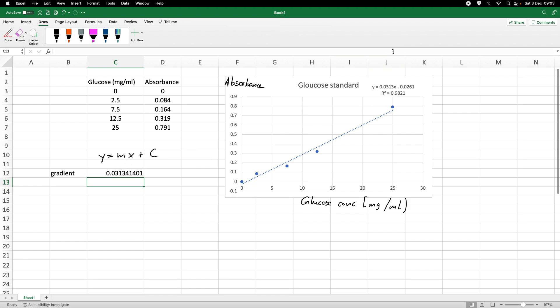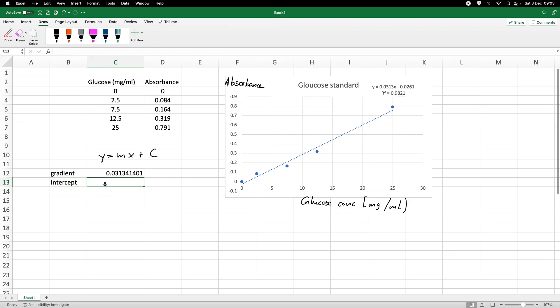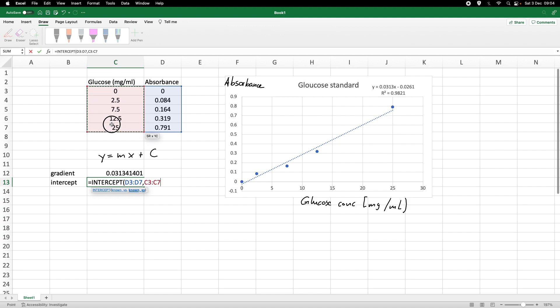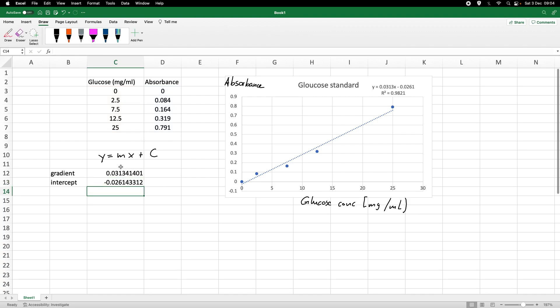We can do the same for the intercept using equals INTERCEPT, again entering the y values first, then the x values. This confirms our intercept of -0.0261.